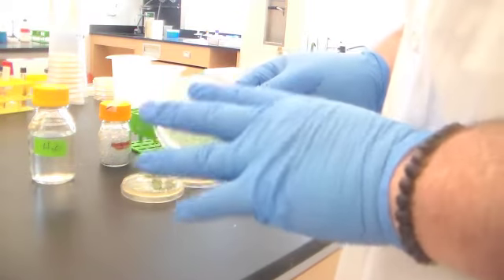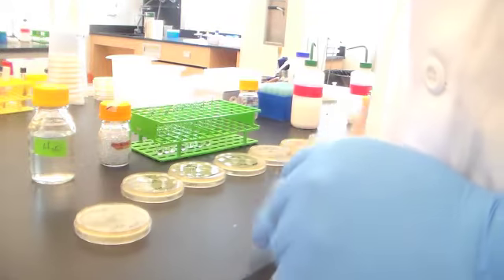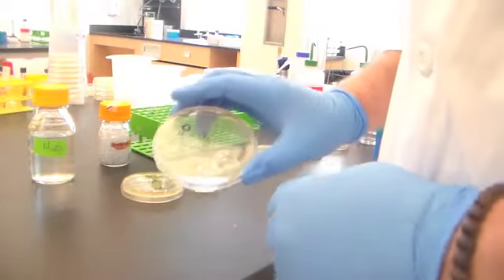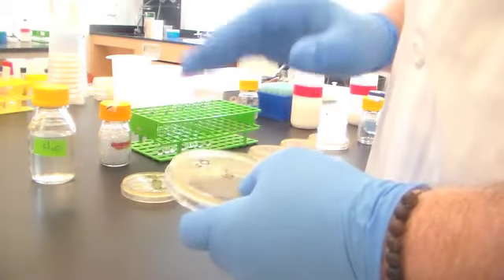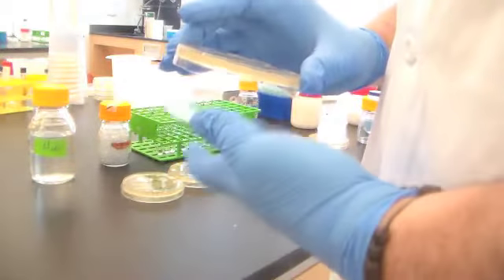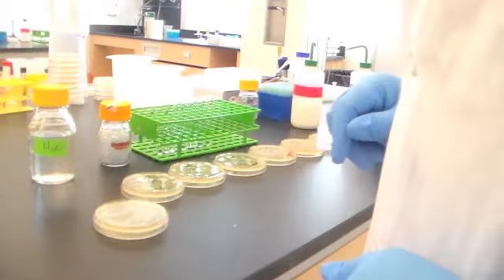So you can almost never put too much information on a plate, but it's very easy to put too little information on a plate. And again, just as a reminder, always label the agar side and not the cover side, because as these get stacked in the incubator, if the stack is knocked over, there's no guarantee that the right cover gets back on the right plate. But if your labeling is here, you're in good shape.